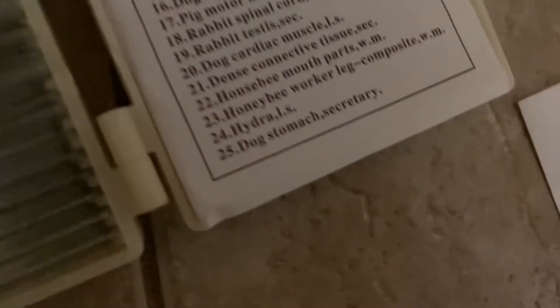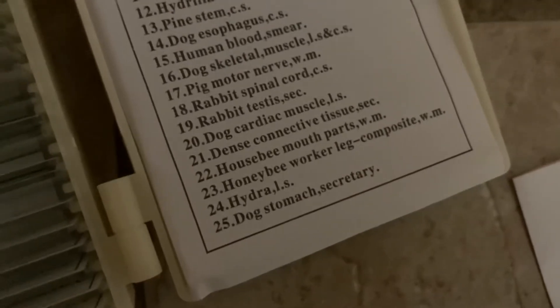Let's see what can look cool — honey bee mouth parts, number 22. Found the mouth part — you can see it says honey bee, or house bee. I think I just mispronounced it the first time, sorry guys, I'm not a biologist so I wouldn't know.